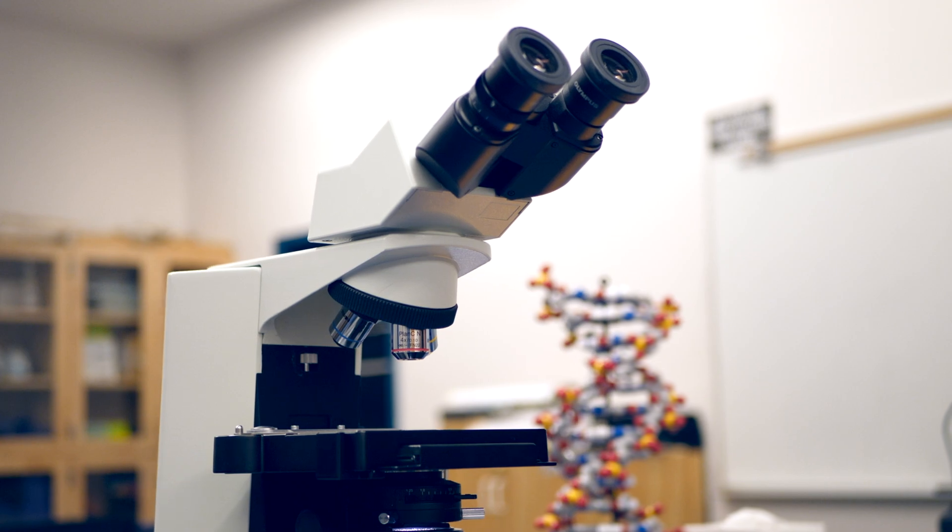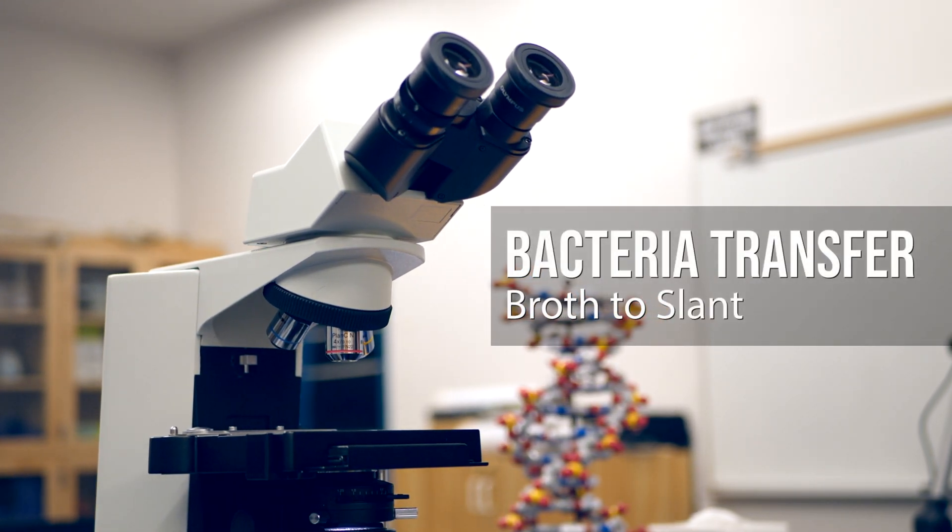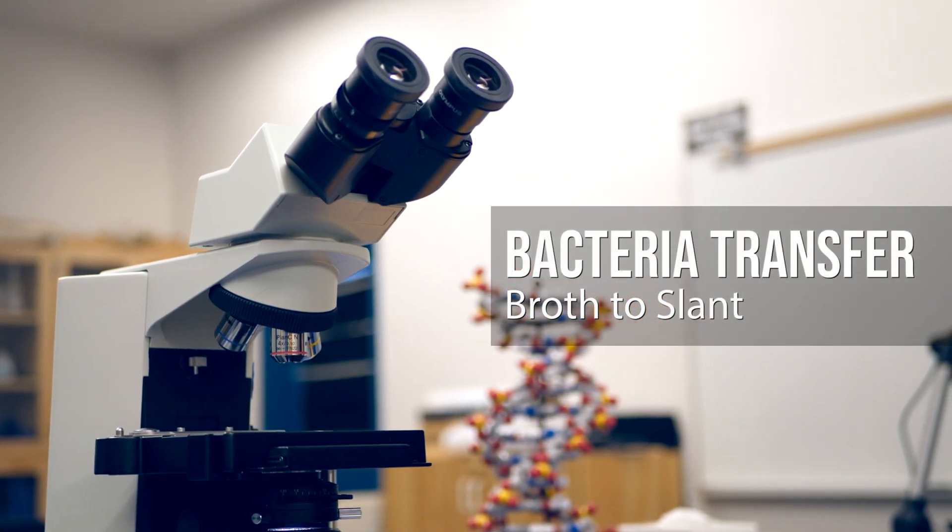In this video we will show you how to do a bacteria transfer from a broth to a slant.